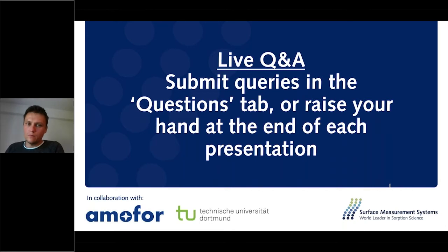Okay. Ira has also a question. Knowing the overall interaction landscape is important, but shouldn't knowing specific interactions that are playing a role determine the landscape? Maybe there are coexistence or competitive interactions in ASD. What do you mean specifically by that? This is right. Do you mean, for example, that a very strongly interacting polymer is beneficial for making a stable ASD, but not beneficial for having a good dissolution profile? Or how do you?